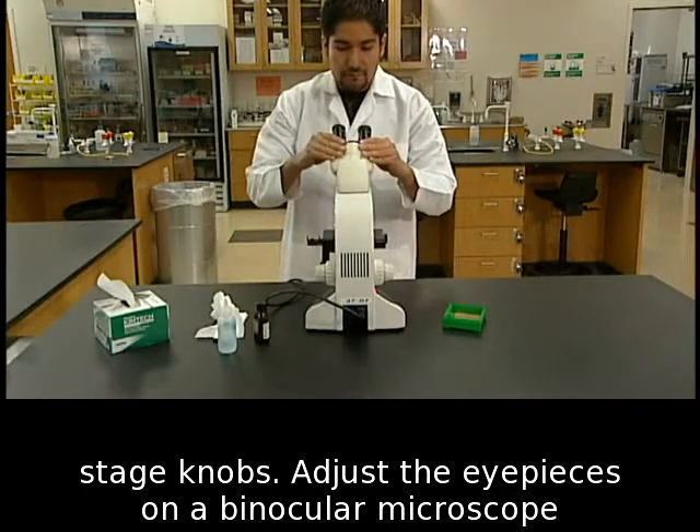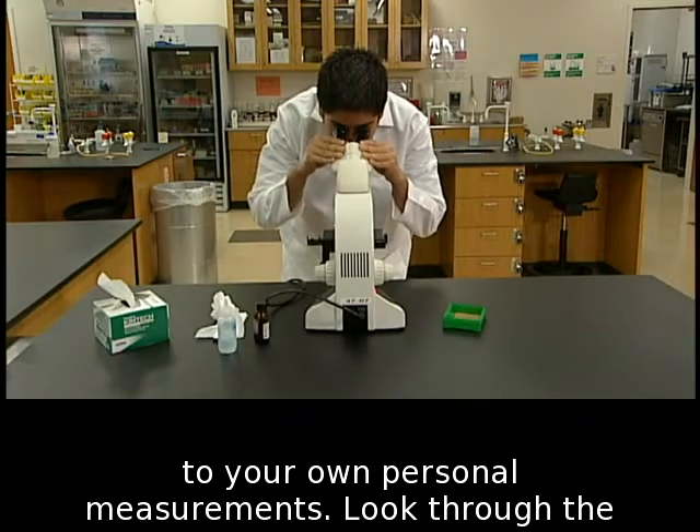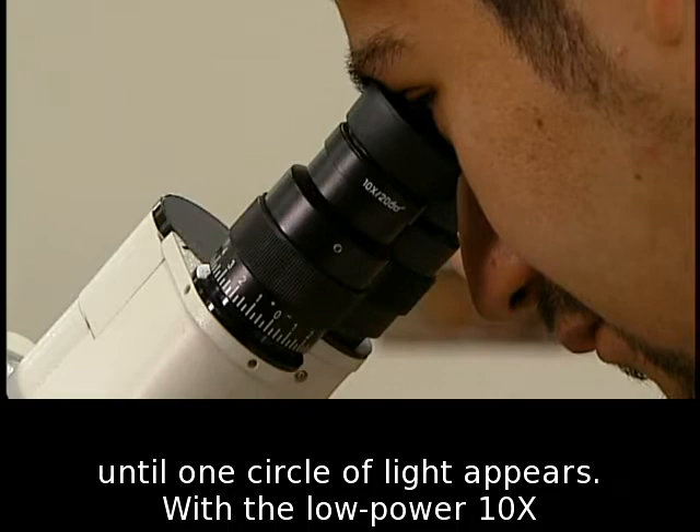Adjust the eyepieces on a binocular microscope to your own personal measurements. Look through the eyepieces and adjust the distance between the eyepieces until one circle of light appears.